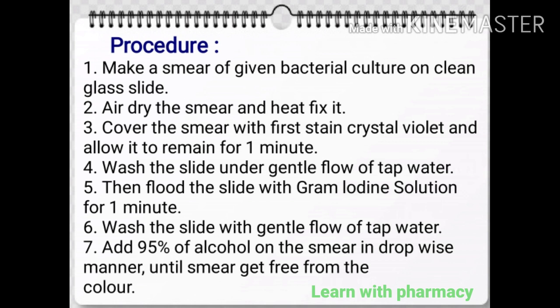Procedure: First, make a smear of given bacterial culture on a clean glass slide. Then next, air dry the smear and heat fix it. Then next, cover the smear with first stain crystal violet and allow it to remain for one minute. Then next, wash the slide under gentle flow of tap water.